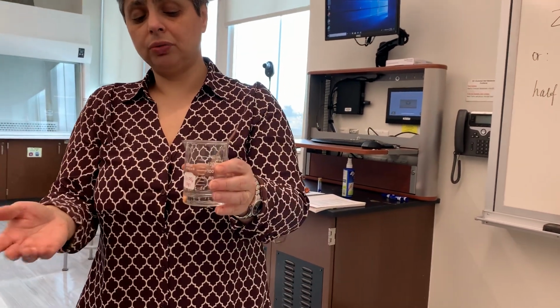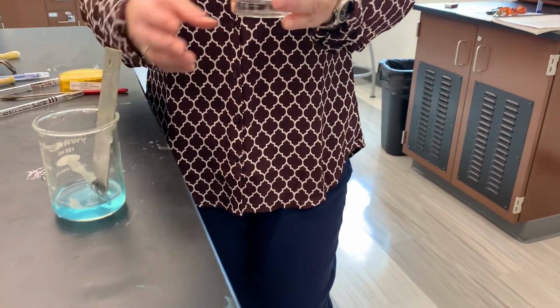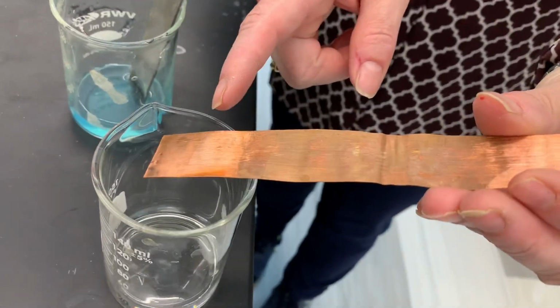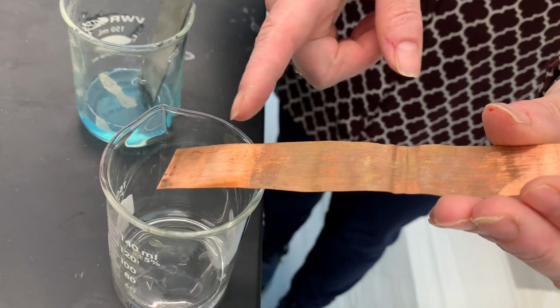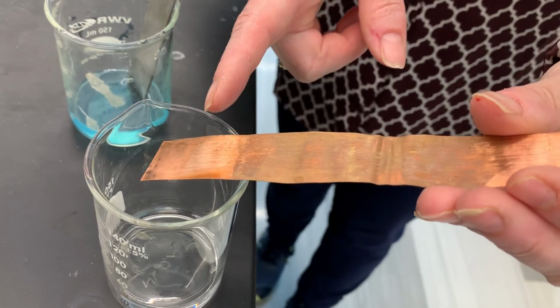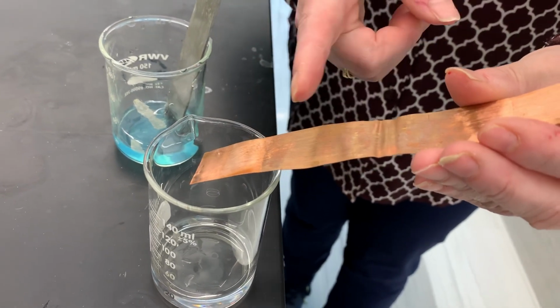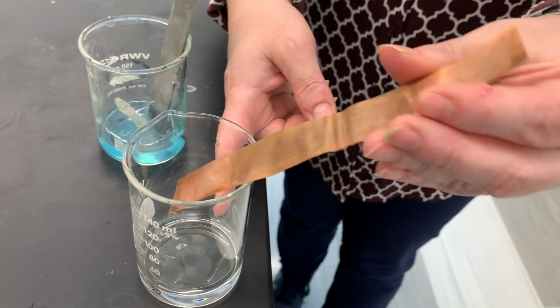What am I trying to do here? Well, I'm trying to show you which reaction will actually occur versus the one that will not. So let's consider this copper. Hopefully you can see that the bottom portion of the strip is no different in appearance than the top portion. Well, maybe it is slightly different because it's simply wet, so it's a little shinier. But it certainly doesn't show any sign of chemical reaction beyond that. So will copper metal react with zinc sulfate? No, because copper is a less active metal than zinc, so copper cannot replace zinc from its salt.